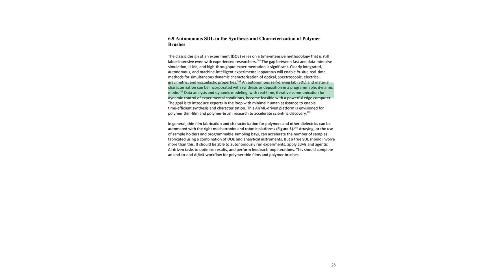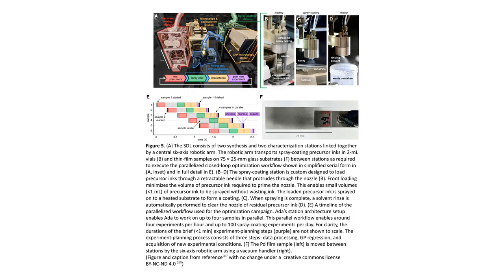For spectrochemical methods like XPS and FTIR, ML can automate the analysis of complex spectra to quantify elemental compositions or identify functional groups. The integration of AI/ML into synthesis, simulation, and characterization all leads to a single transformative vision: the Autonomous Self-Driving Laboratory, or SDL. An SDL is a closed-loop system where a robotic platform physically carries out experiments, analytical instruments characterize the results, and an AI brain analyzes the data in real time to decide what experiment to do next. The goal is to create a virtuous cycle of data, feedback, and experimentation that can operate continuously with minimal human intervention.